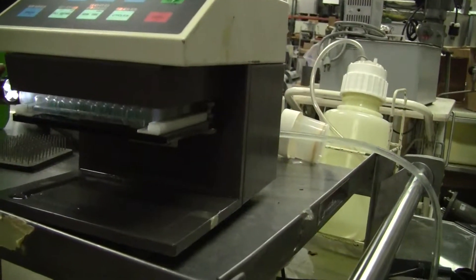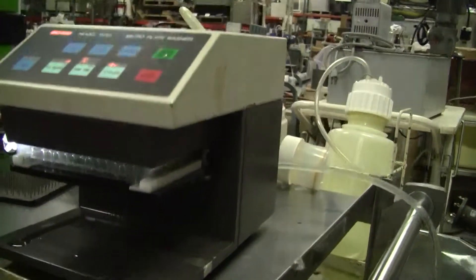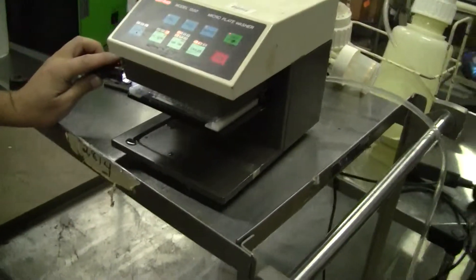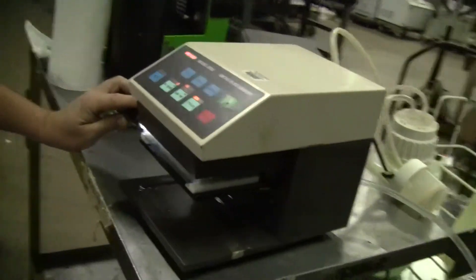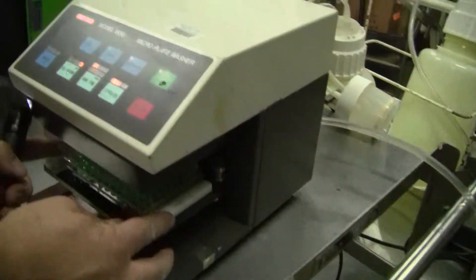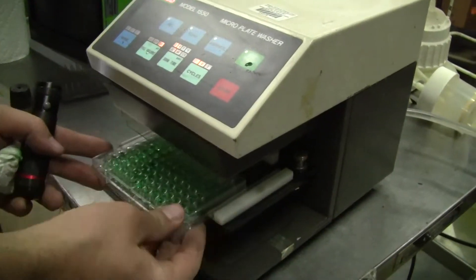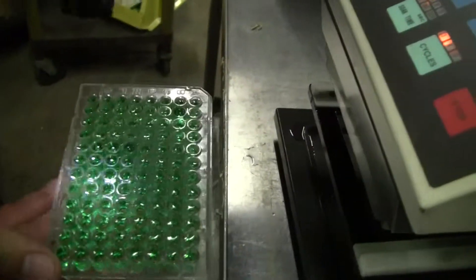Yep, there we go. Beautiful. I'm going to stop it on this rinse here, and hopefully we can bring this out. What we'll have is a tray full of green liquid.